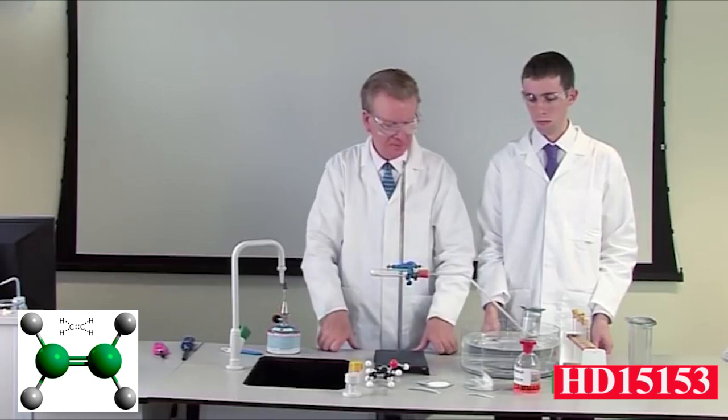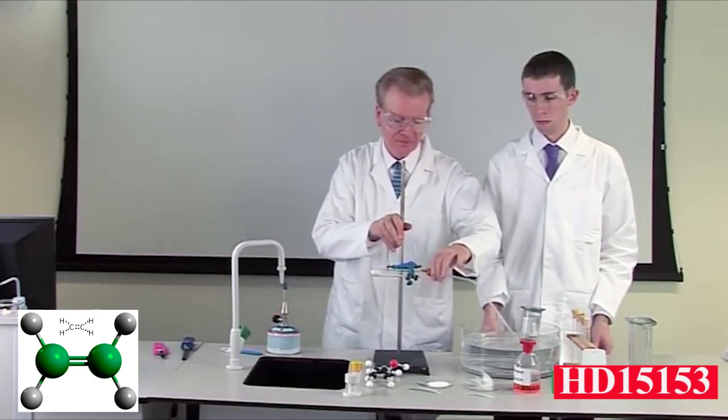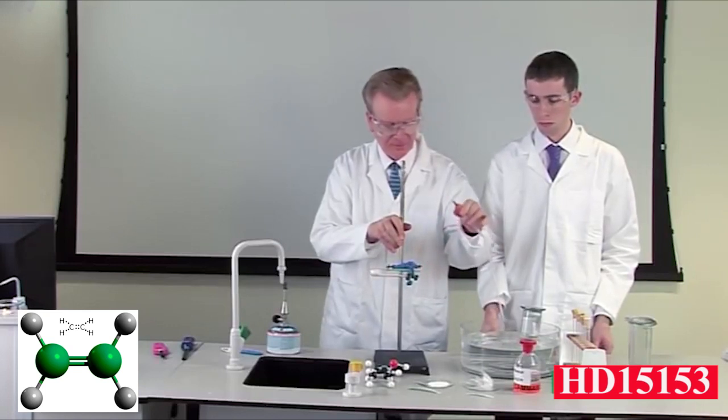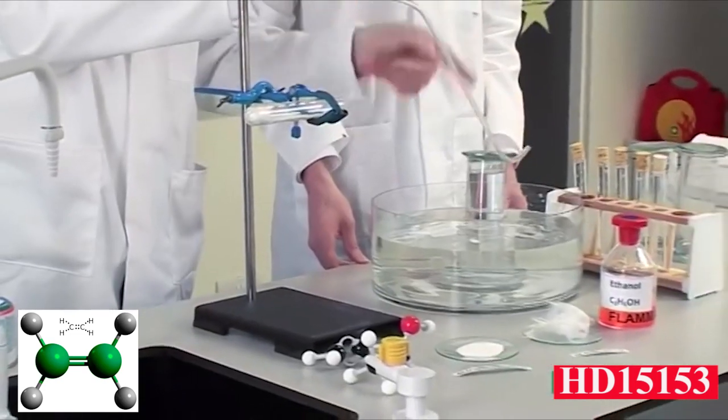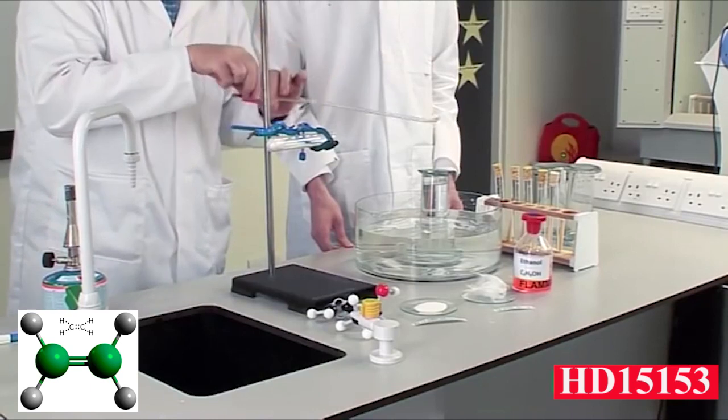If the delivery tube were simply left in the water trough, a suckback of water would occur since the boiling tube begins to cool as soon as the Bunsen burner is turned off. The cold water could cause the hot boiling tube to crack.